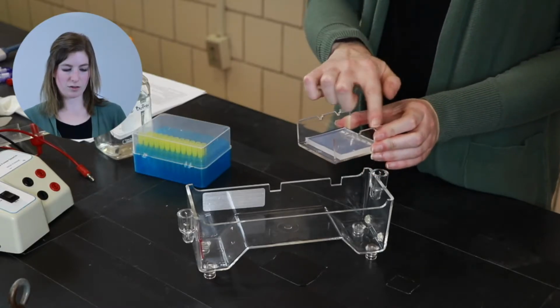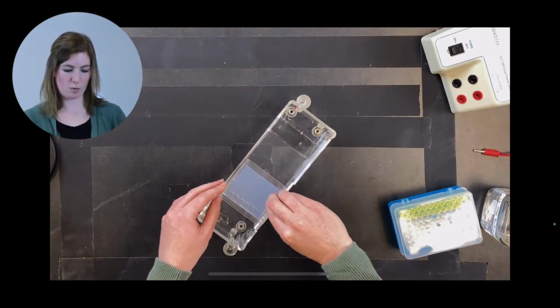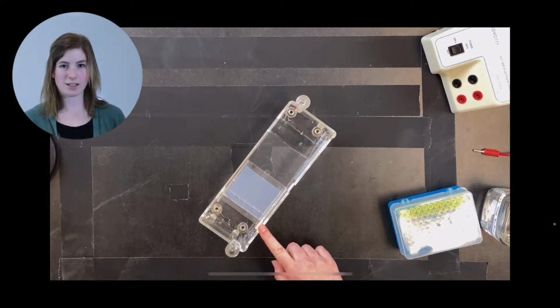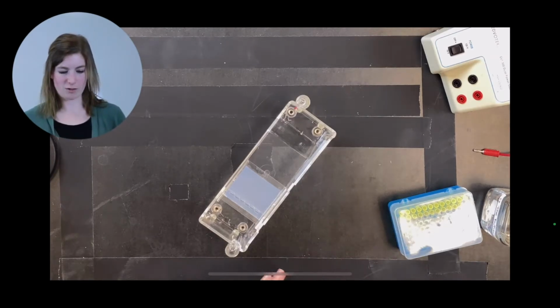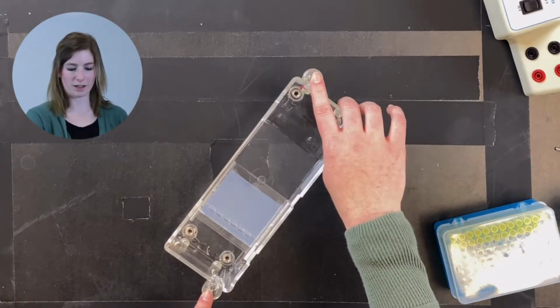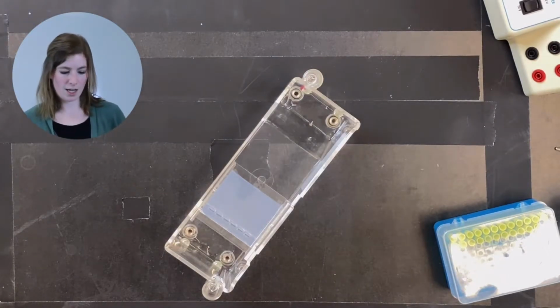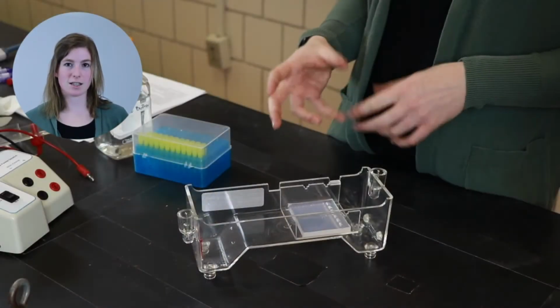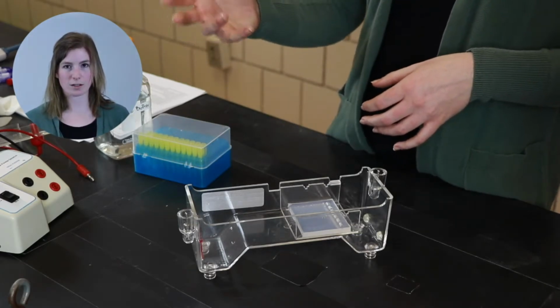This little plastic piece actually stays on and it fits right into it so that it doesn't move around too much. So I'm going to put it right there. The notch makes it really easy so that our sample runs in the correct direction. What I'd like to point out to you is there is a black electrode on this side and a red electrode on this side. The red one is where the positive electricity is going to be, and the black represents the negative. This is important because DNA is negatively charged, which means when I turn this on, it's going to be attracted to that positive electrode.